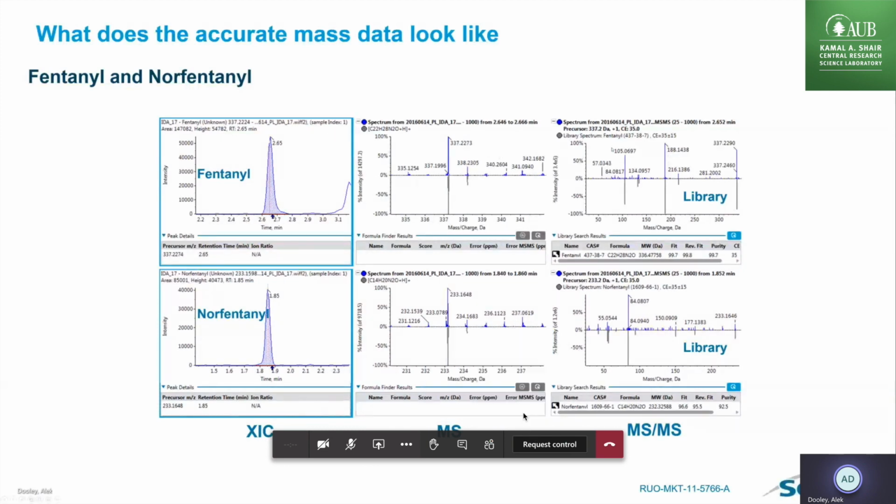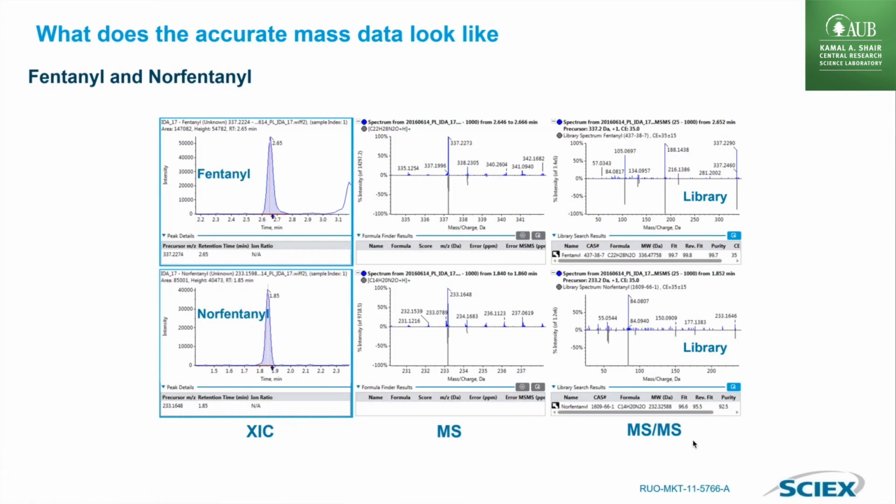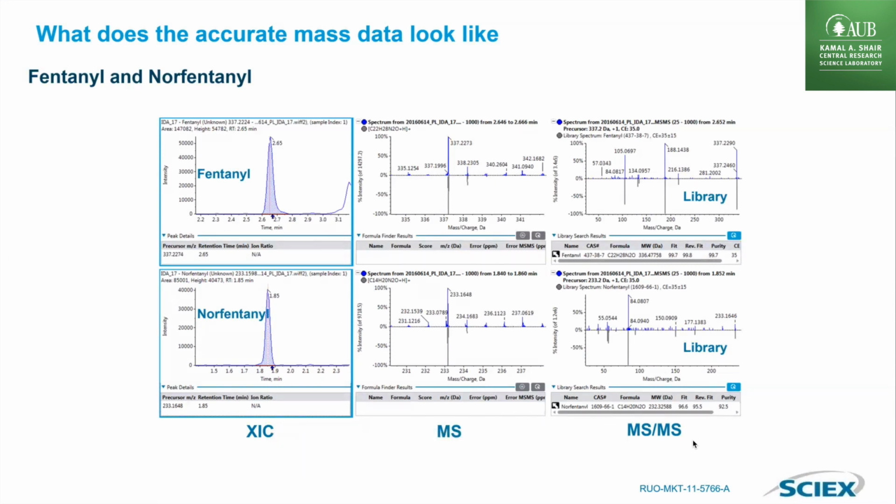And then here on the right side is the new information. This is the MSMS. All of these ions here, our library is a collection of MSMS scans of known compounds, and that's stored in the database. We call it a library. And so we can do something with MSMS data called library matching. That's one of the main reasons why we want to collect MSMS information, in order to search it against the library.